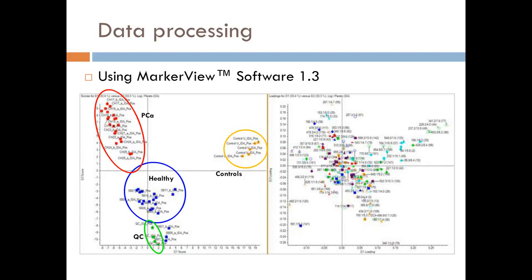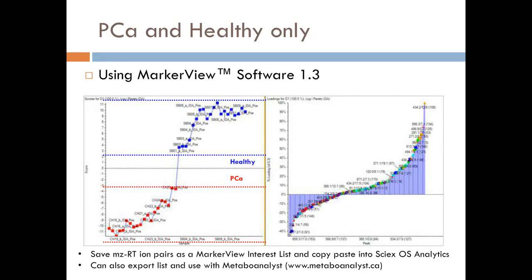Then we have our clinical study, where our healthy subjects are clustering very close together, and those that have prostate cancer are clustering up at the top. So this shows us, in the beginning, the ability to separate the prostate cancer subjects from those that are healthy, which is what we wanted. So we're now seeing the ability to use just metabolomics, without looking at which metabolites are there, but using the global expression to separate one group from the next, and getting good quality measures using two separate kinds of controls. You can then pull out specific information, the masses and the retention times of those masses, to correlate which metabolites are expressed in which group. On the left, you're going to see those that have prostate cancer, with examples of metabolites that are differentially expressed in prostate cancer versus those on the top that are healthy.